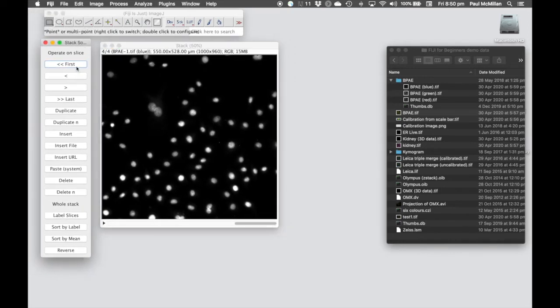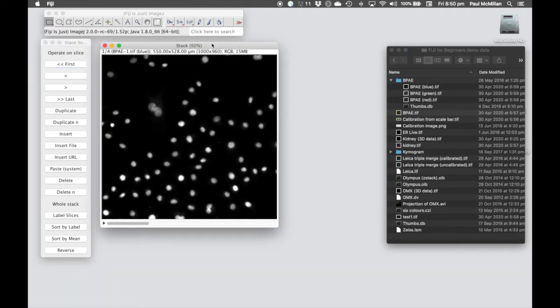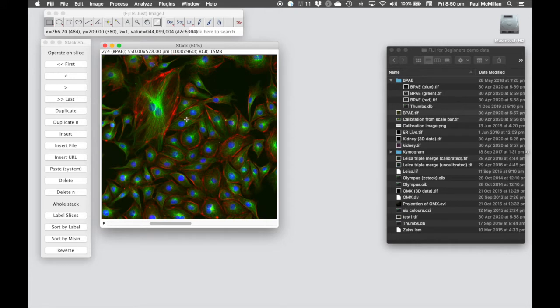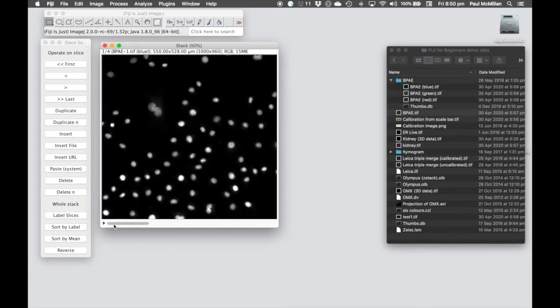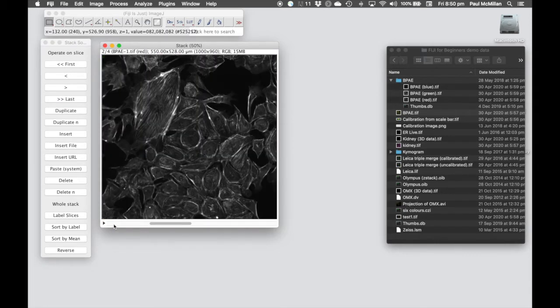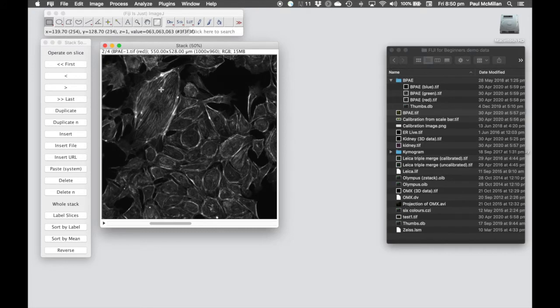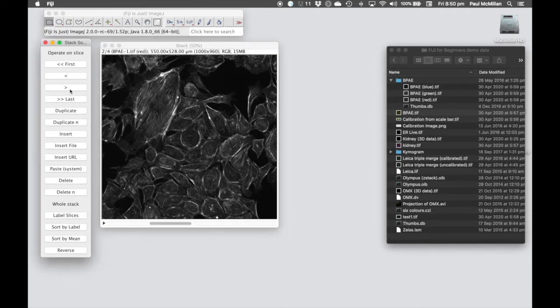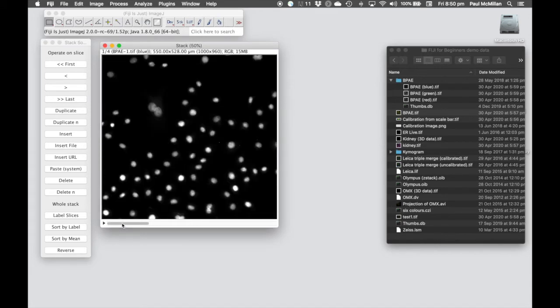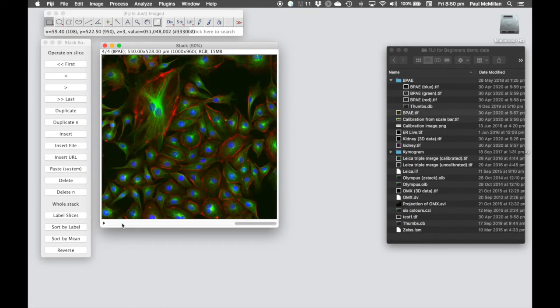We go to Image, Stacks, Tools, and use the Stack Sorter tool. Here we assign the current selected image to a position. We move the blue channel to first position, then arrange in order: blue, green, red, and finally the merge channel in the last position. We can move images one step at a time until the order is: DAPI, green, red, then merge.